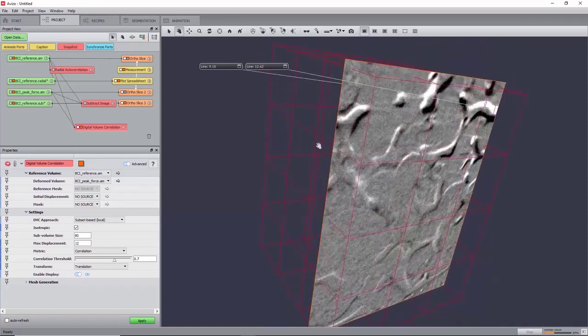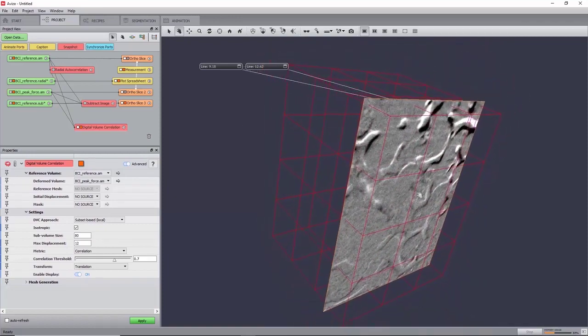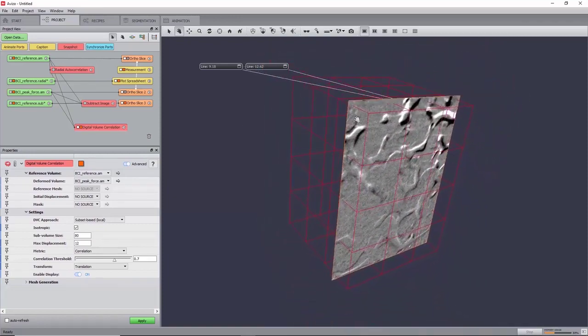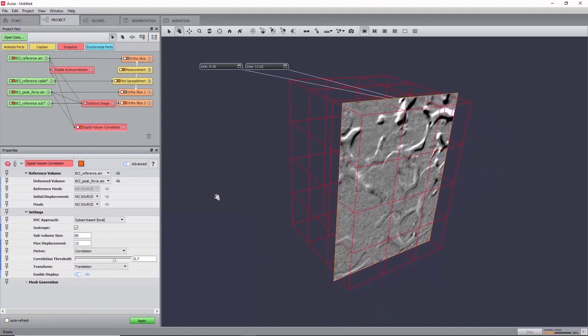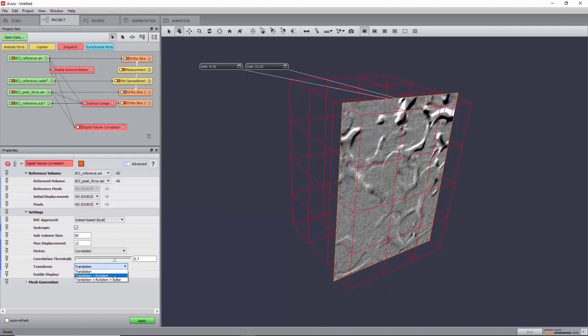You can now have a render of the subdivision into sub-volumes. Keeping the metric to correlation and the correlation filter to 0.7 will result in any sub-volume with a metric inferior to 0.7 to be ignored and interpolated instead. Finally, set the transform port to Translation plus Rotation, and now run the algorithm by clicking Apply.